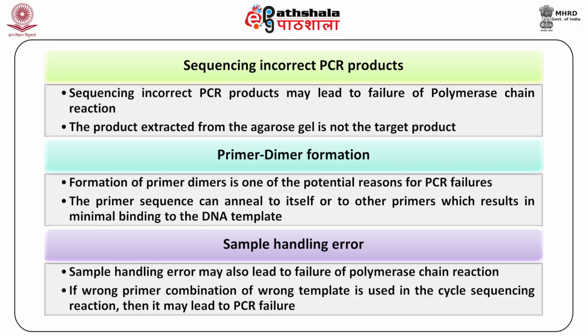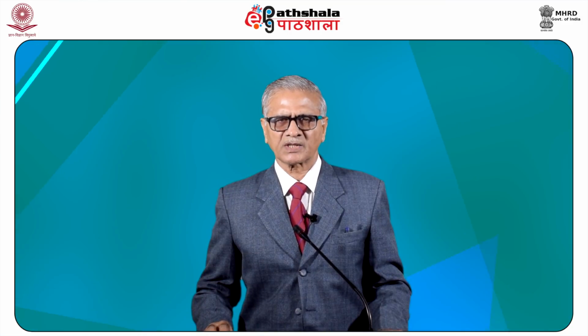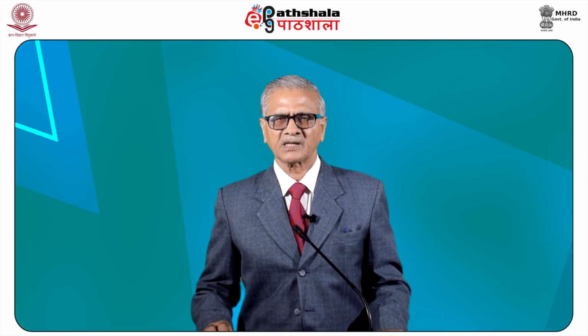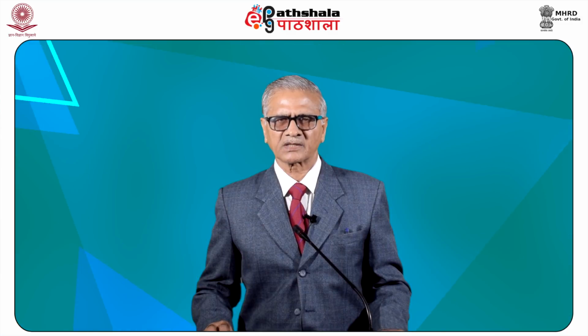Sample handling error may also lead to failure of the polymerase chain reaction. If a wrong primer combination or wrong template is used in the cycle sequencing reaction, then it may also lead to PCR failure. Now, what are the solutions to this PCR inhibition? For that, proper steps or solutions must be undertaken to prevent PCR inhibition. PCR inhibition may lead to polymerase chain reaction failure, producing unreliable and inaccurate results.